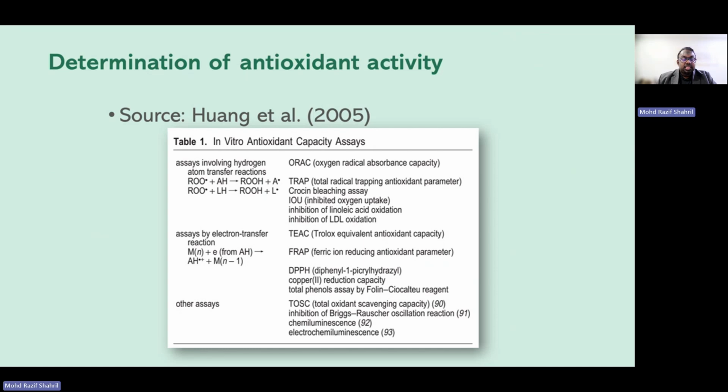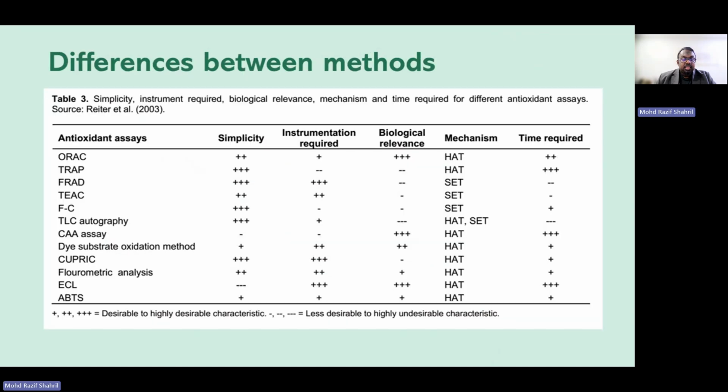Most of the assays utilize colorimetry, relying on the fact that differences in color result in differences in the absorption of light, which can be measured with a spectrophotometer. For example, the DPPH and ABTS assays use colorimetry to measure the reaction with organic radicals, while the ORAC relies on the loss of fluorescence.